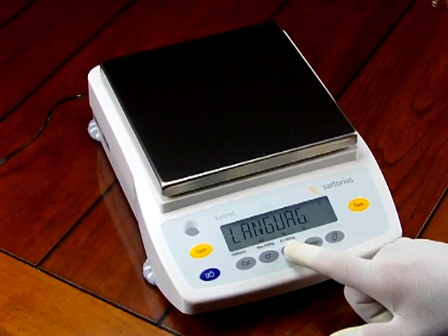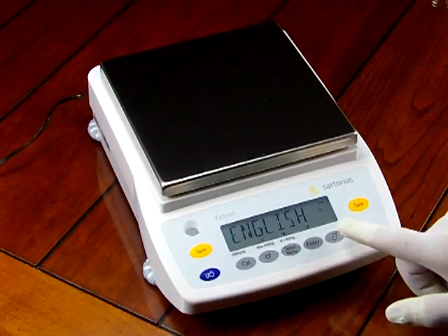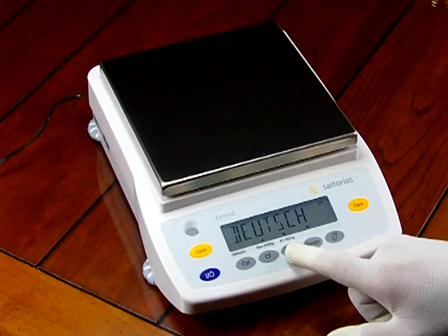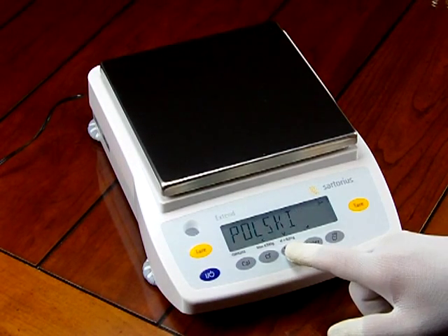There are so many features with this balance. Here's where you can change the language. Going into the language mode, you can see English is currently selected — indicated by the circle in the top right corner. You can change it to German, French, Italian, Spanish, or Polish.